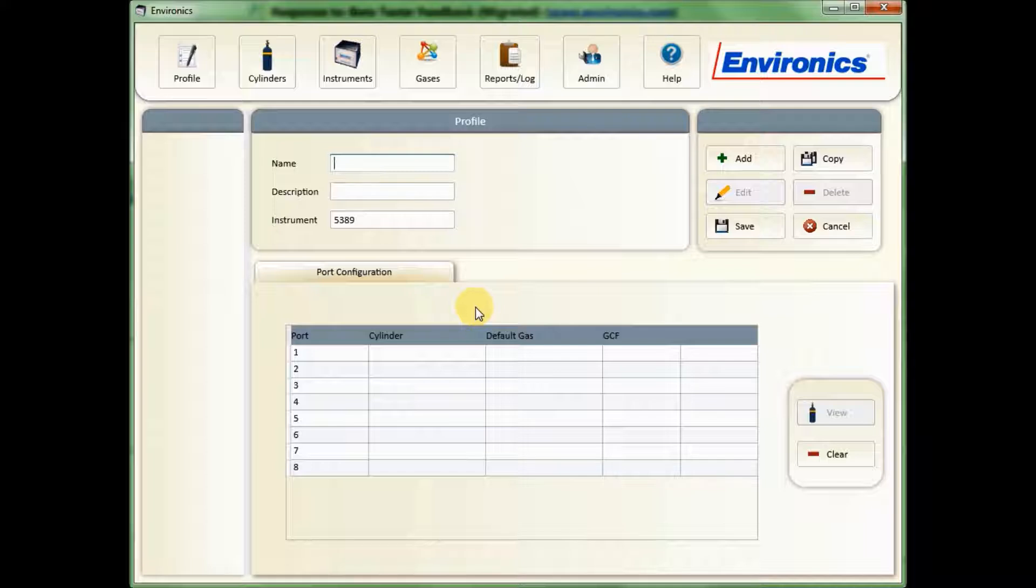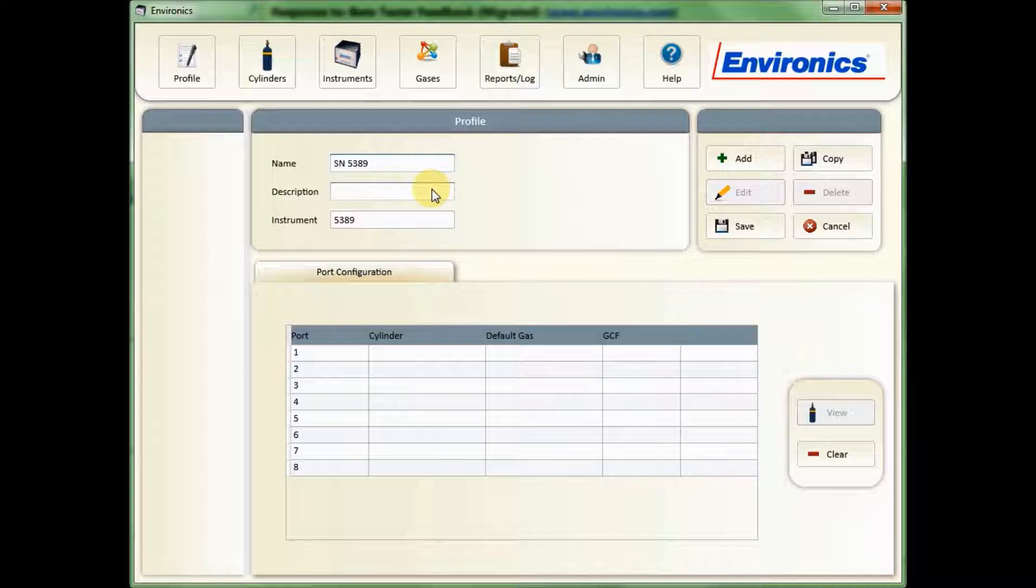Select that and click OK. I can give the unit a name. I'm just going to call it 5389 again. You can give a description if you'd like to as well.